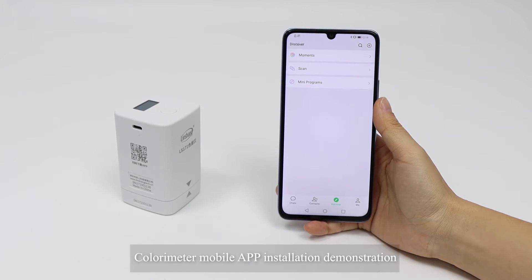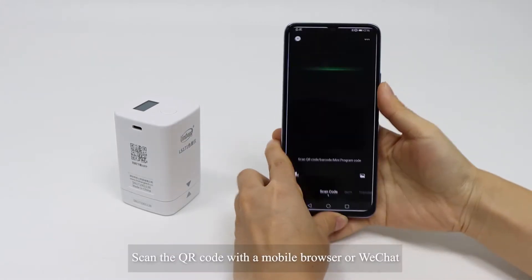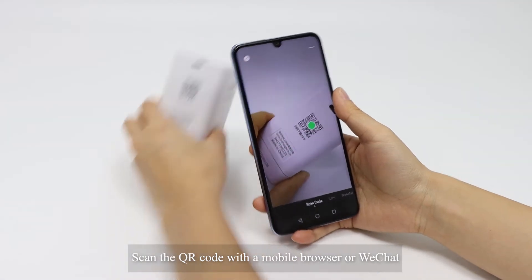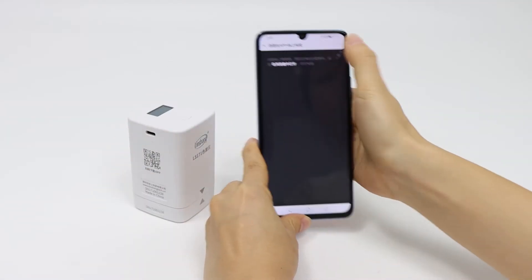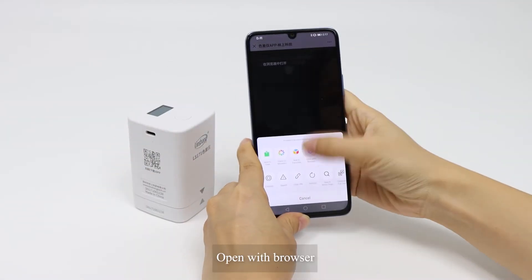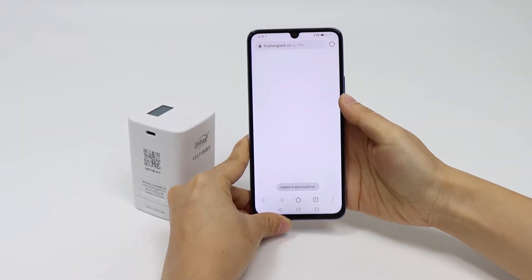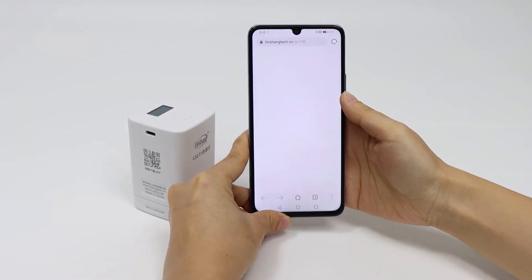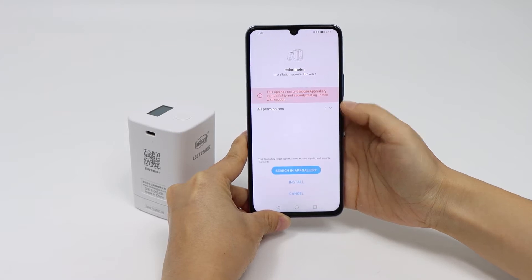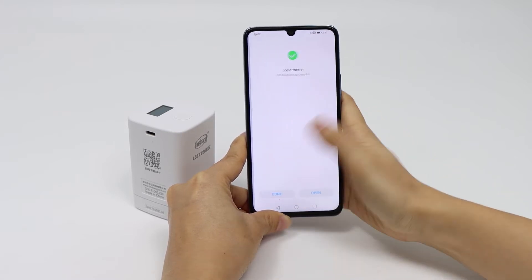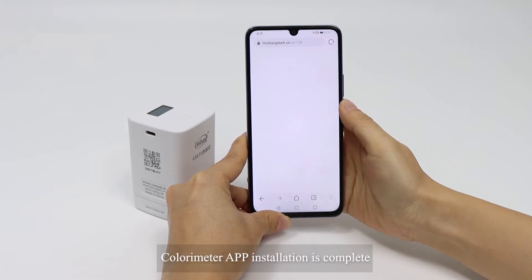Colorimeter mobile app installation demonstration. Scan the QR code with a mobile browser or WeChat. Open with browser and follow the prompts to download. Click to continue installation. Colorimeter app installation is complete.